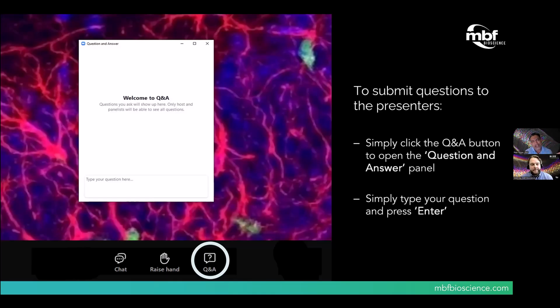And generally, for live samples, I would keep 200, 300 gray levels if you want to minimize. But for cleared samples, 1,000, 2,000 from minimum to max is sufficient for the analysis part. You have enough dynamic range in the system. But yeah, it's a sample dependent process.